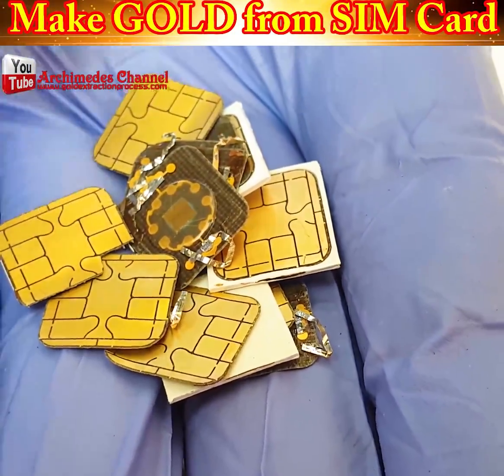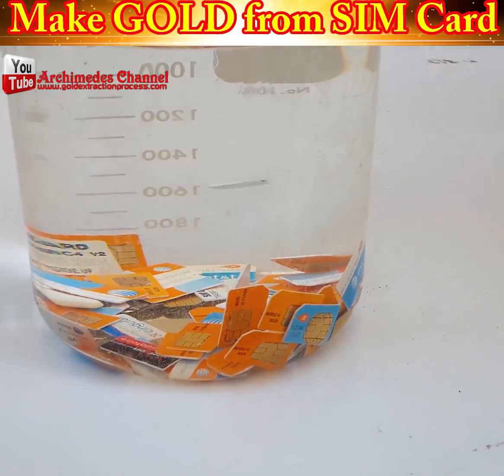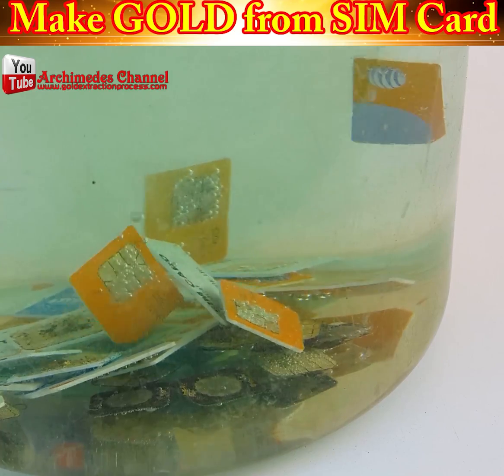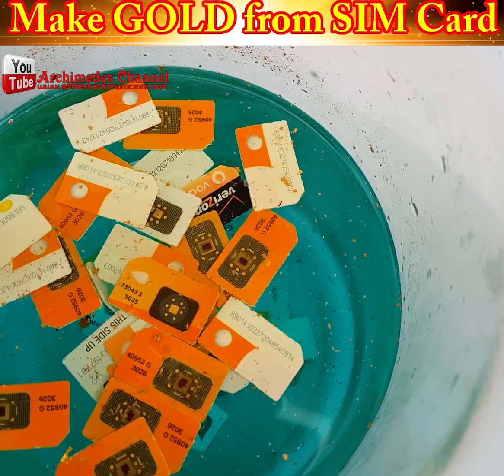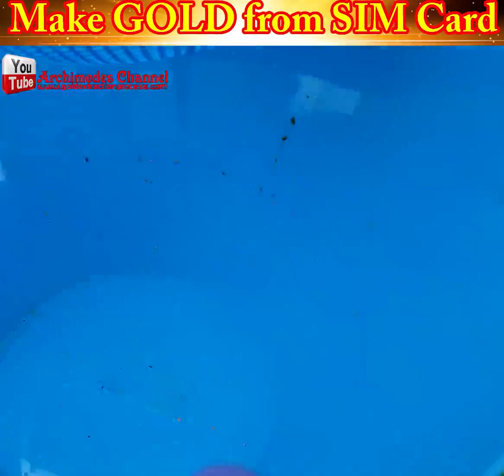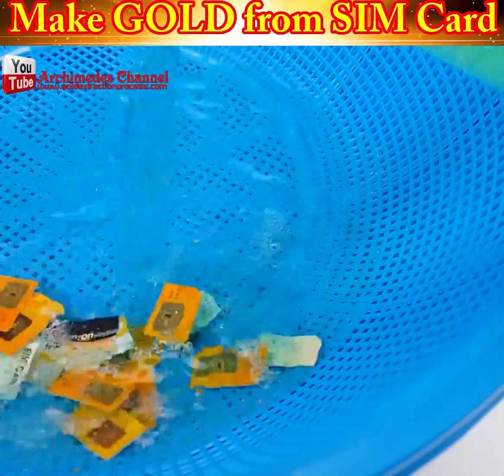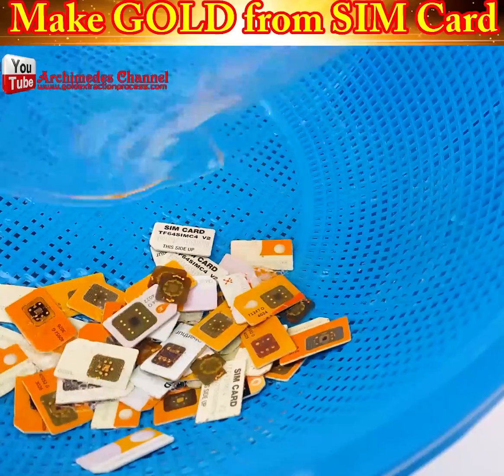Did you know that there's gold in your SIM card? There's actually gold wire and gold contact strips built right into them. Admittedly, there's not enough in one SIM card to make you rich — they wouldn't be designed that way — but here is how to extract it.